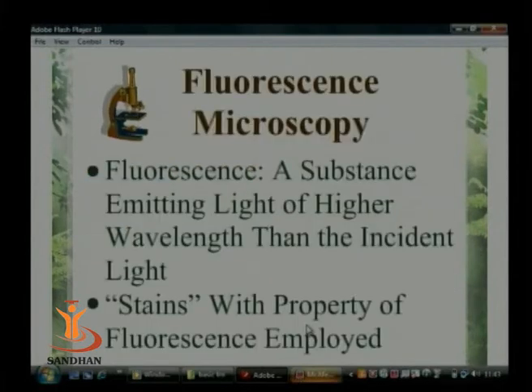One more variety is the fluorescence microscopy. The fluorescence microscopy also has made a very useful contribution in understanding of the cell structures and different components of the cell. The term fluorescence, I believe and I very sincerely hope, should be known to the students. The fluorescence is a phenomenon where a substance emits light of higher wavelength than the one which it has absorbed. This particular property will be depicted well in the next slide, what exactly happens in the phenomenon of fluorescence.